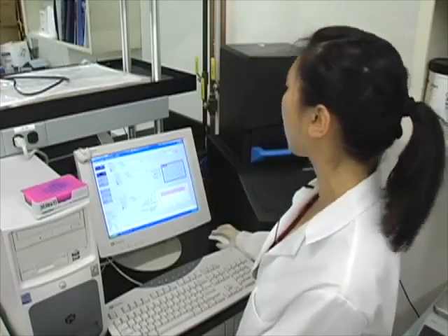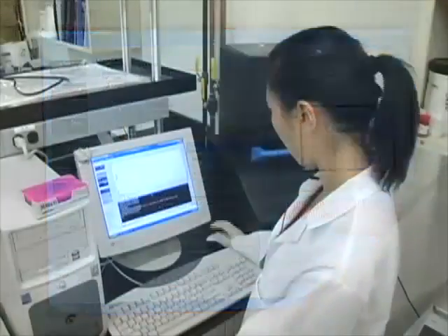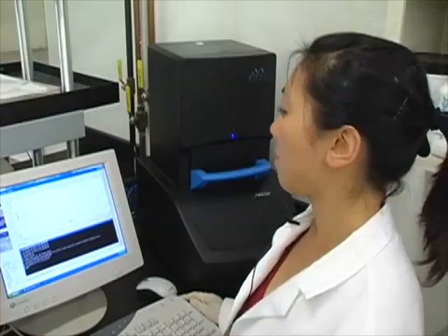So we have our plate set up and we have our protocol loaded. All we have to do now is run our qPCR. And it's starting at the 3-minute denaturing step. From my experience using the primers that I'm using and using the tail samples and looking for the genes that I'm looking for, I know that my positives will start to come up around 25 cycles, crossing a cycle threshold of significance. Now, when that crosses is highly dependent upon your tissue sample and what you're looking for and how much of the DNA is present initially.